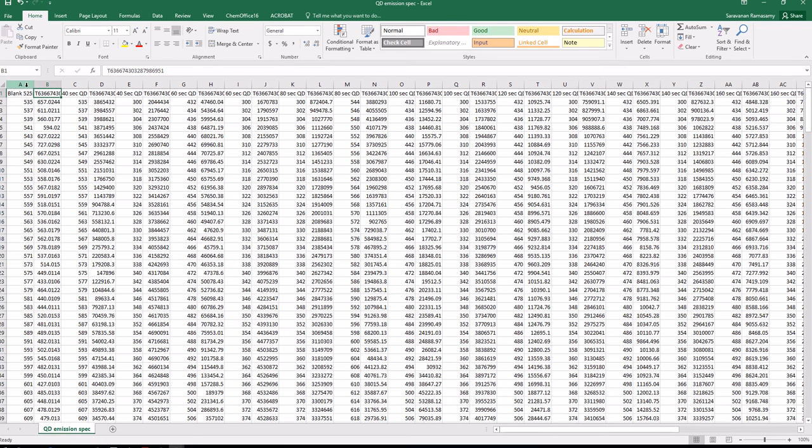In the emission graph, we put all the emission data. In the excitation graph, we put all the excitation data. Like there are 5 or 6 excitation graphs that we combine in one graph. In the emission graph, we combine all 5 or 6 emission samples.